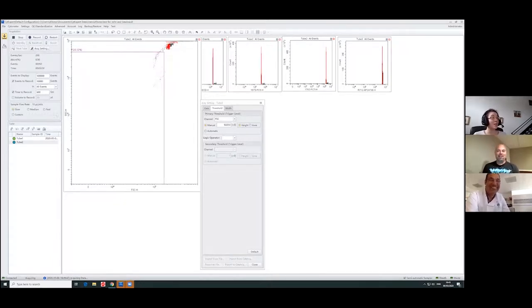Yeah. So should you keep your sample flow rate on the lower side to also help counteract the abort noise? I'll show you that trick as well. Oh, that trick's coming up. Okay, I'm jumping ahead.